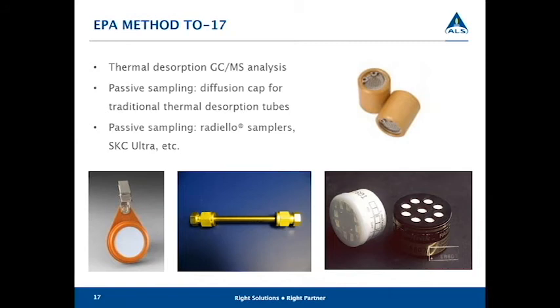And another one from Lauren. She says, is there an additional cost for ultra low canisters? And what is that charge, please? Nicole, you want to take that one? Yeah, I guess everybody's definition of ultra low varies. Generally speaking, I think she's referring to SIM. When we do SIM certification, typically those canisters are individually QC'd.